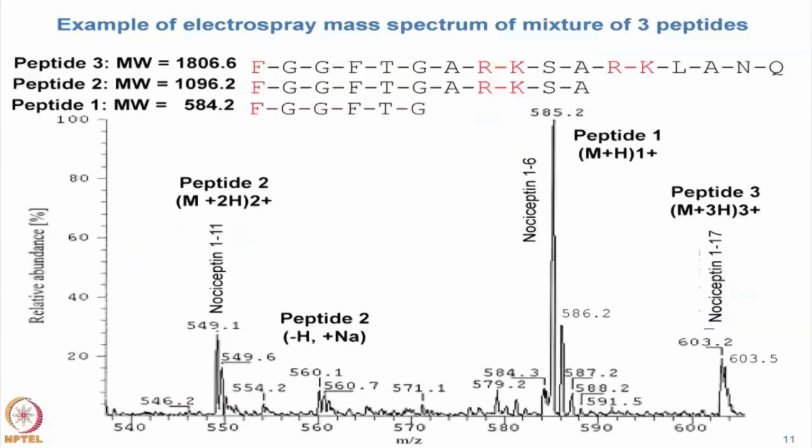If we label it a little differently, one of the things you can see is that the masses of those peptides, after you account for the charge, convert it back to singly charged. This peptide has no basic residue, which is why it's easily singly charged. This peptide can hold two charges, and you typically will have charge on arginine and lysine, and then on the N-terminus as well. Okay? It's also possible to hold charge on asparagines and glutamines.